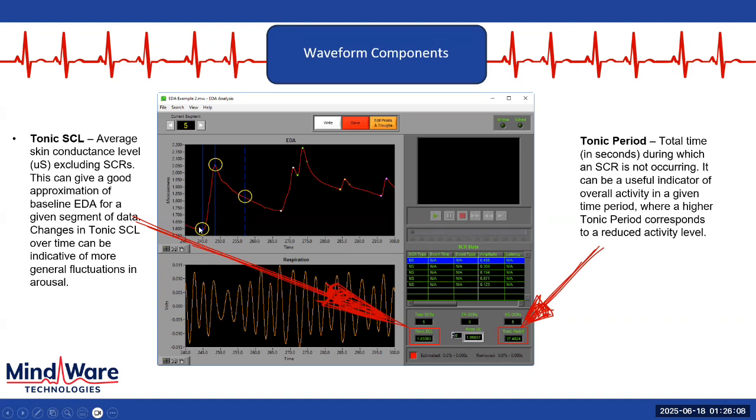So, including the tonic and phasic periods there, what is the mean level here? And so, looking at this between sessions or between people, we're going to see we have our baseline mean skin conductance. We can aggregate all those different sections between there, get an overall average, and then we're just going to do change scores between that and then let's say the condition. So mean skin conductance there, mean skin conductance there, and then potentially even comparing that to a recovery afterwards.